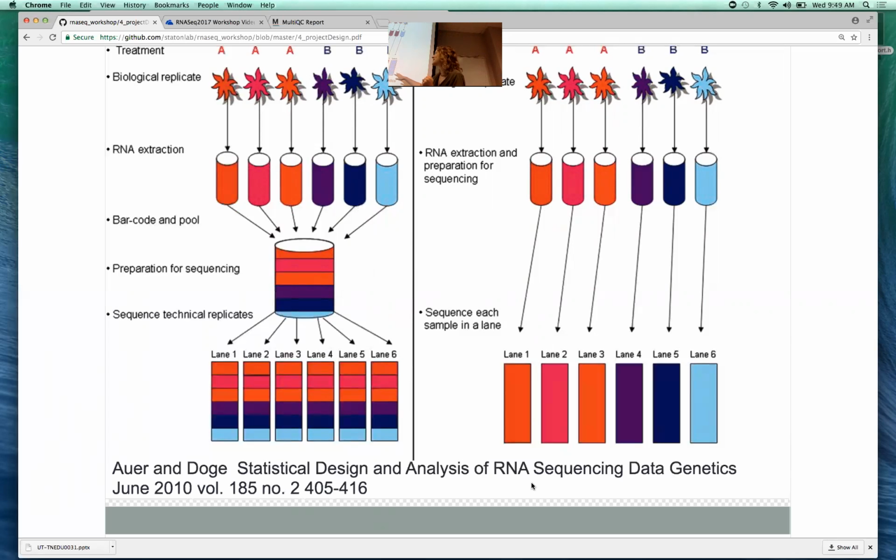Yeah, so these are people who are sequencing really, really deeply. This would be a lot of money for sequencing. But I think the principle holds. It's a basic principle: just treat your samples equally. If you know there's going to be variation, don't send all your control treatments to UT Austin to be sequenced, and then all your experimental treatments to Wisconsin. Don't do something like that.